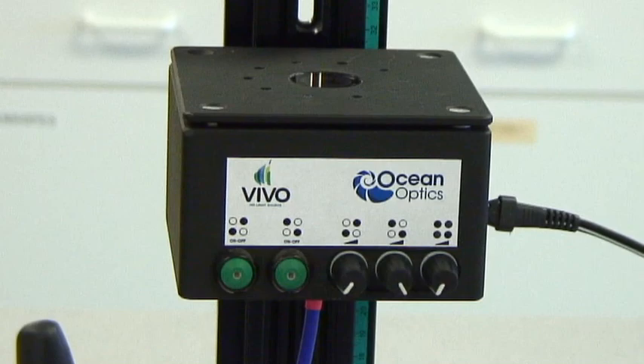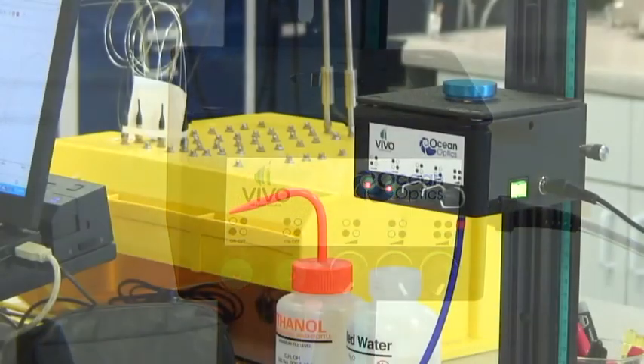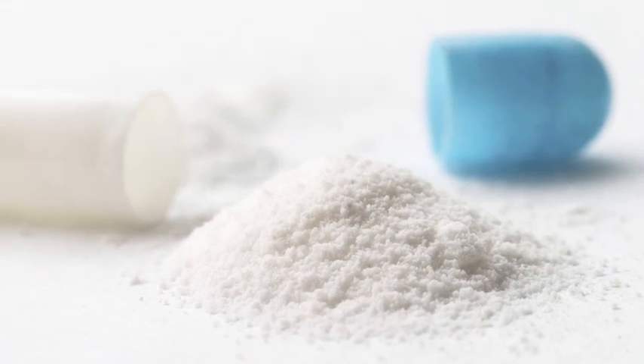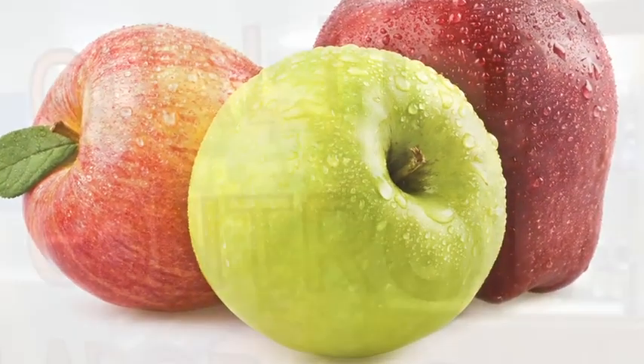Meet Vivo. Vivo is the new near-infrared source from OceanOptics that is a brilliant tool for NIR analysis of pharmaceutical products, food, and more.